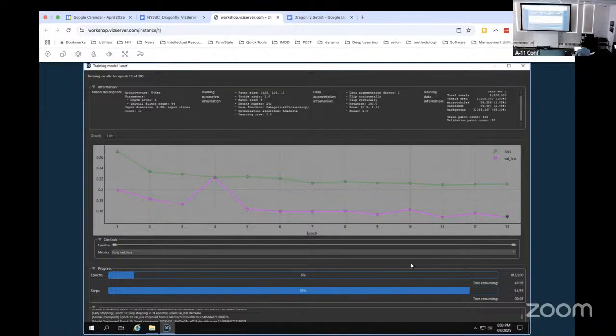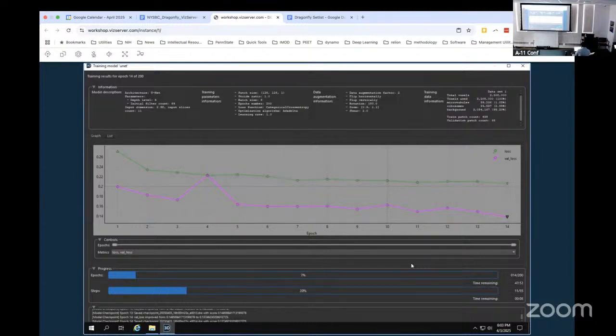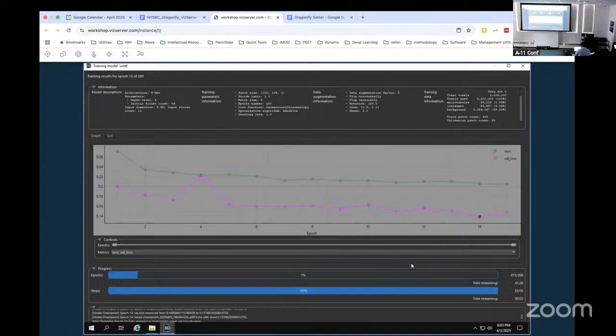Okay, so your crop box and your ground truth have to be the exact same. The first step you should do is assign everything.